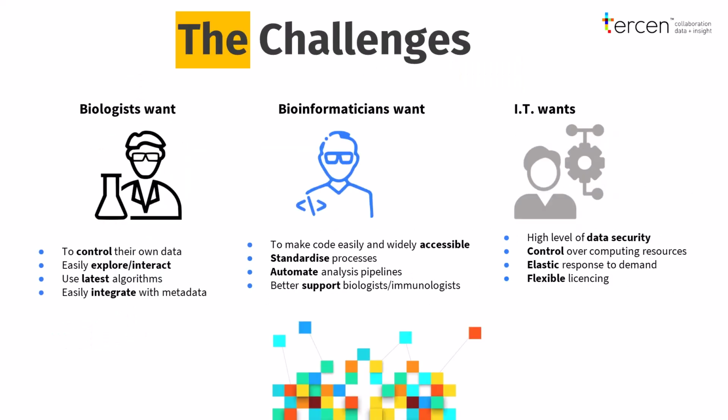We had three main communities. We had the biologist, immunologist, who wanted to control their own data because they spent quite a lot of time generating it. They want to explore and interact with it. They want to use the latest algorithms. For example, if they read a Nature paper and they see an algorithm, they want to be able to use that algorithm. They want to easily integrate extra information, especially if it's biological or clinical, and add extra metadata to their data.